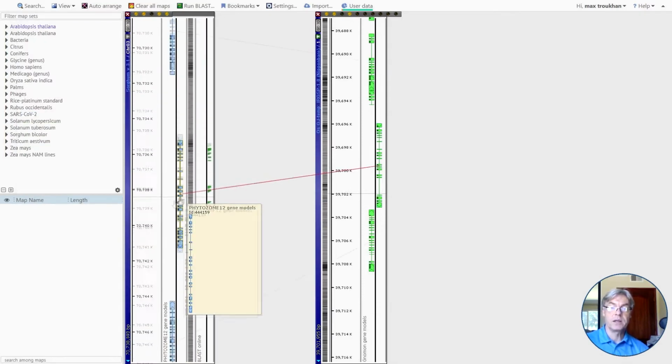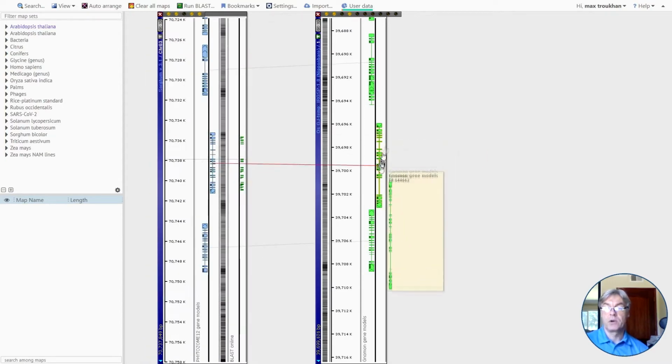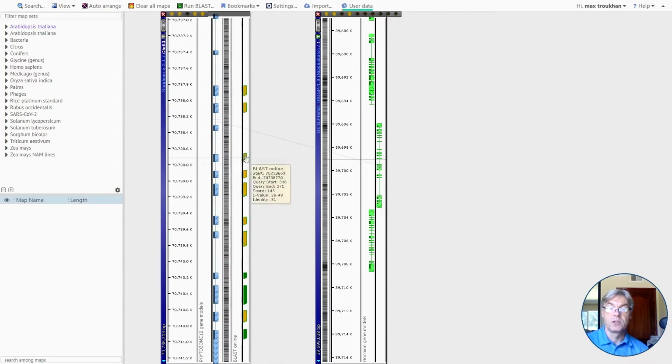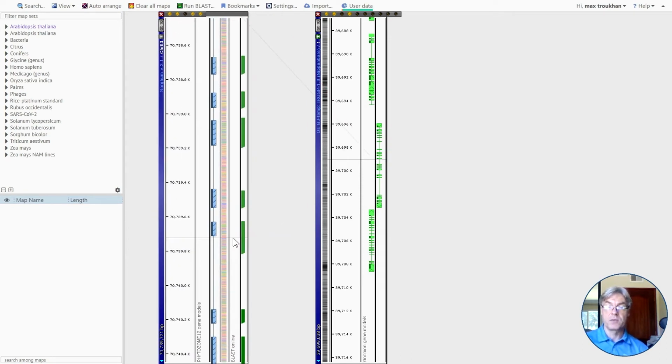So now we're looking at the sorghum chromosome 3, which is aligned to our query here. So this is a track that we just created. It contains BLAST hits, and you will immediately notice that the HSPs are consistent with the gene that was predicted in the same region. But sometimes the HSPs are much longer than exons. What's going on? So this may confuse your algorithm if it takes into account the protein hits.